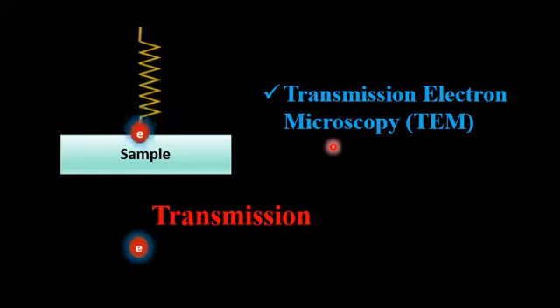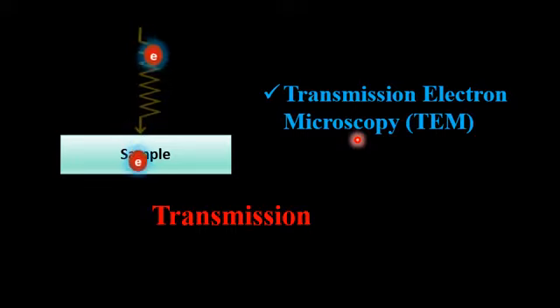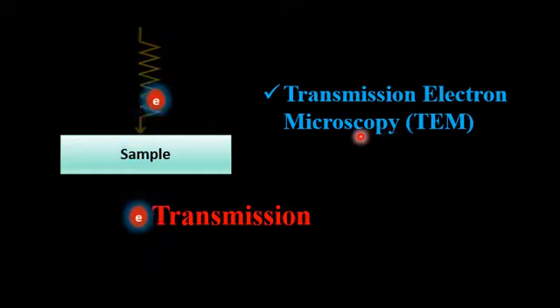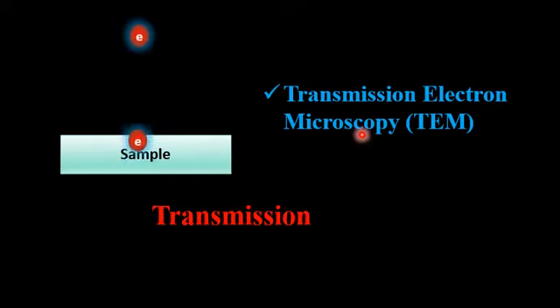If I define the transmission electron microscopy technique, it is a technique in which a beam of electrons is transmitted through a specimen, and the transmitted beam of electrons provides an image showing the variation of energy between the incident beam and after the transmission.